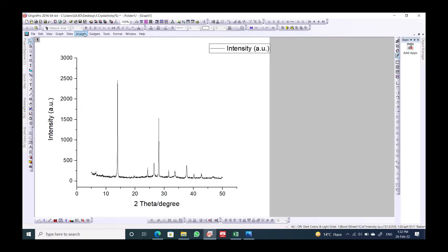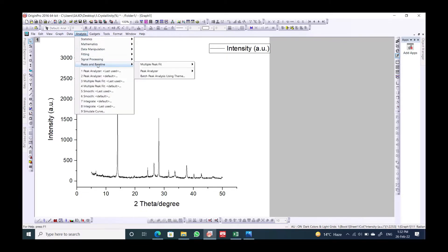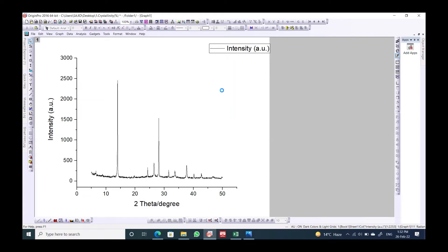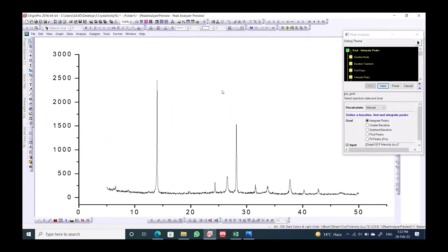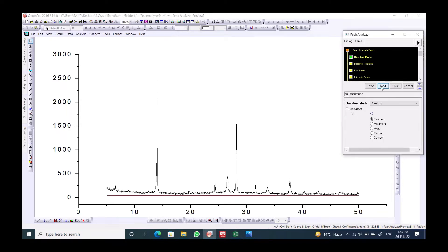For the first step, we have to go to Analysis, then Peaks and Baseline, then Peak Analyzer, and open the dialog. We should check that this is set to Integrate Peaks, then click Next.